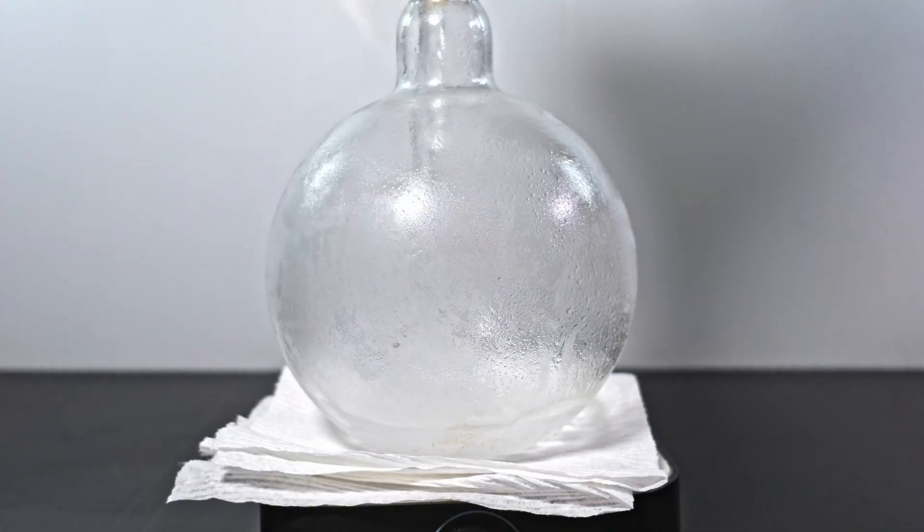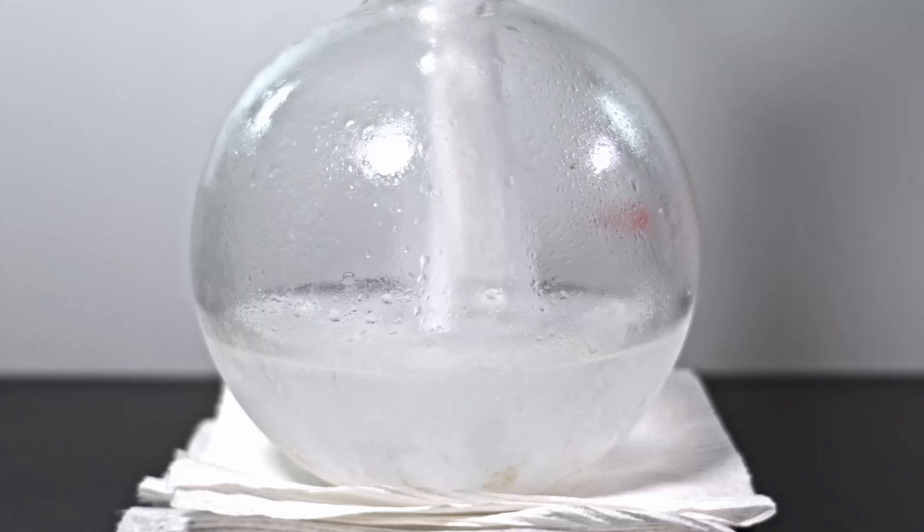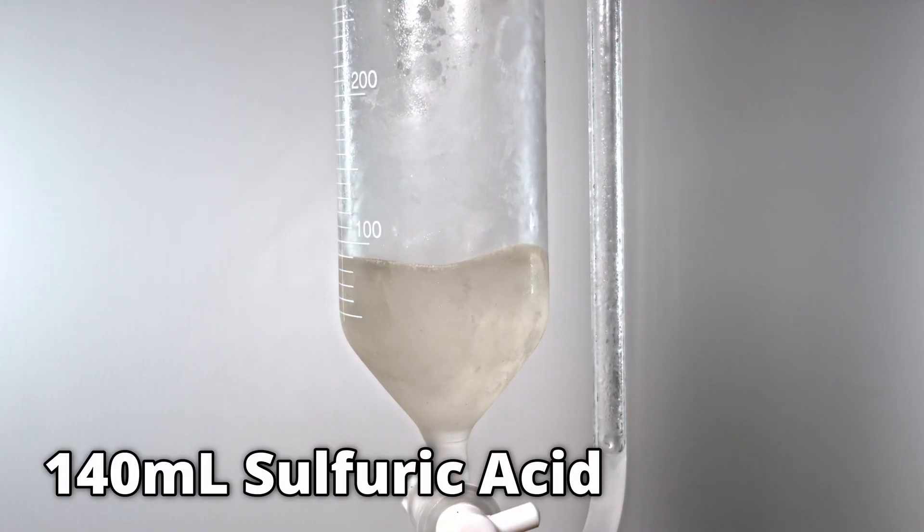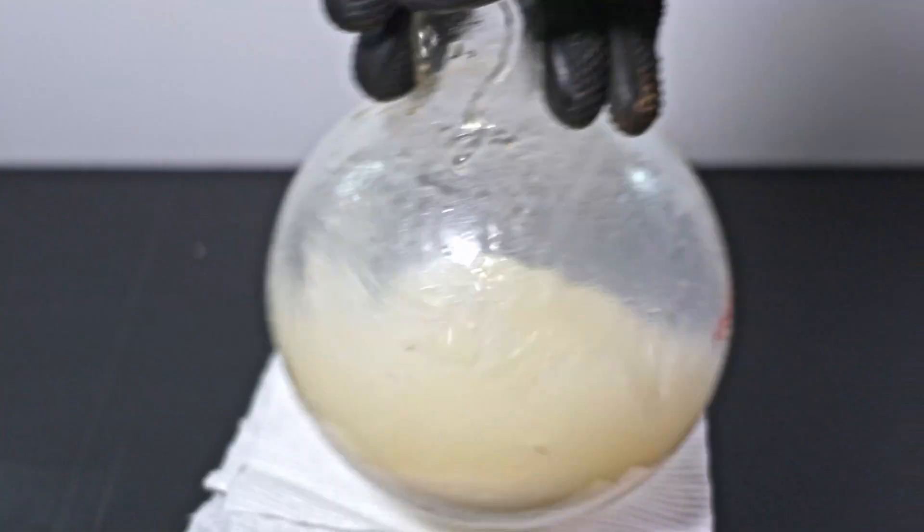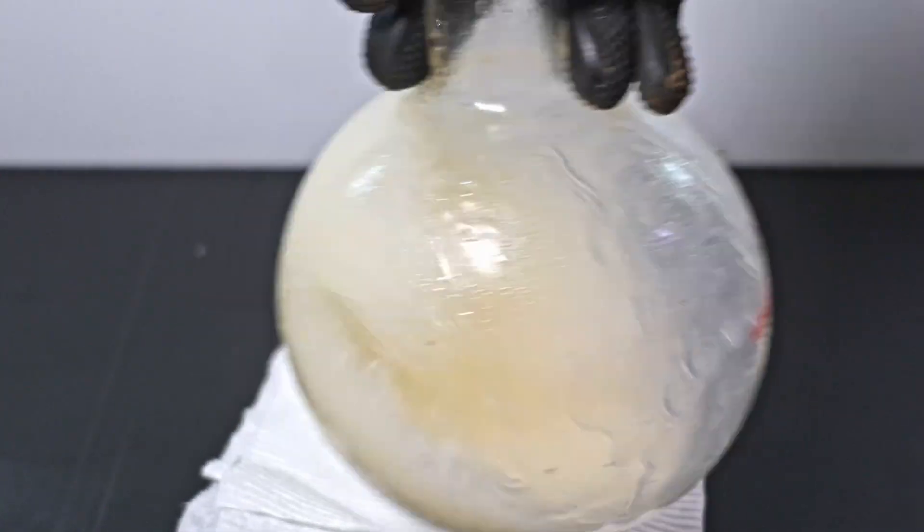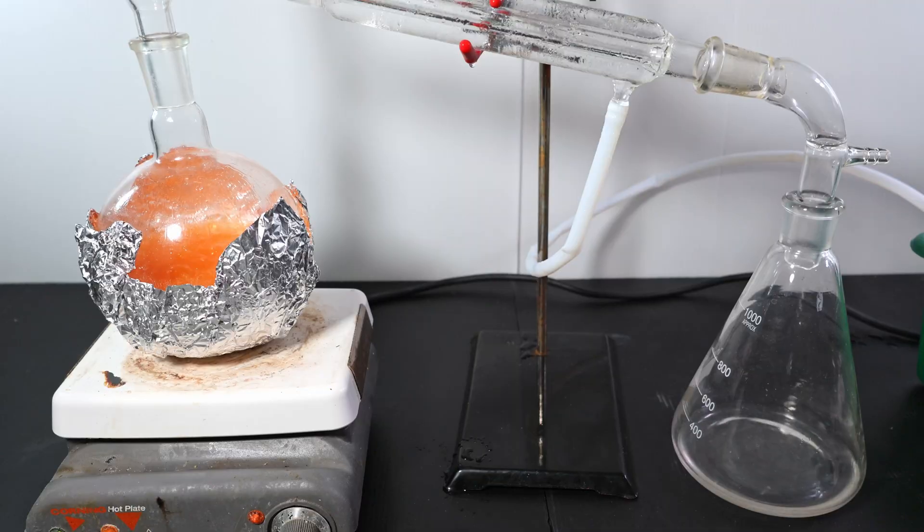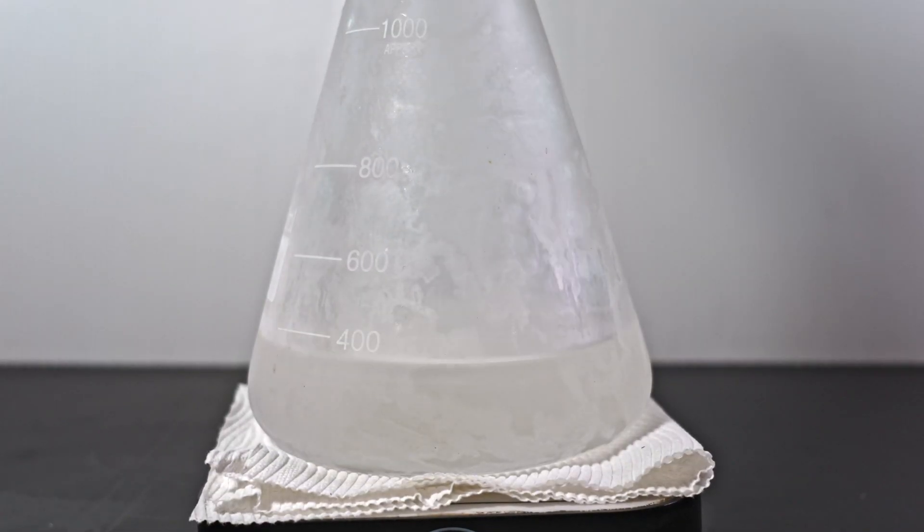For my second half, I again add 300 milliliters of ethanol followed by 250 grams of sodium bromide. I reload my funnel with 140 milliliters of sulfuric acid and manually stir for the duration of the addition. It eventually becomes a nice orange color. I distill off everything again and chill down the distillate to negative 10C.